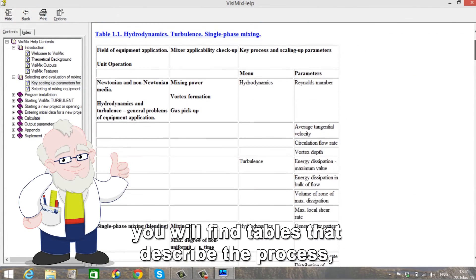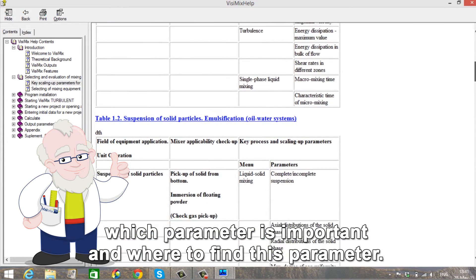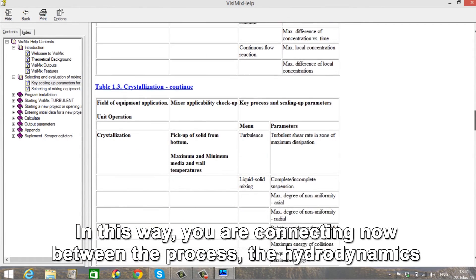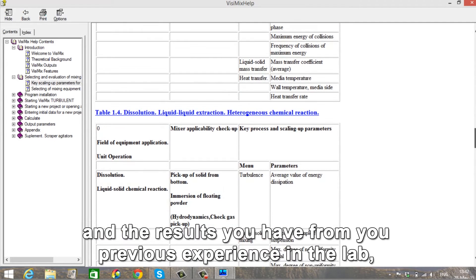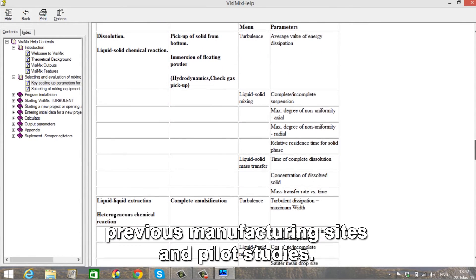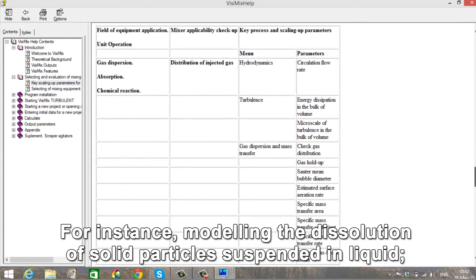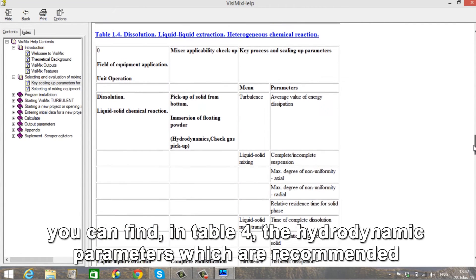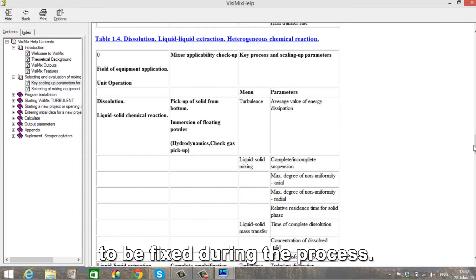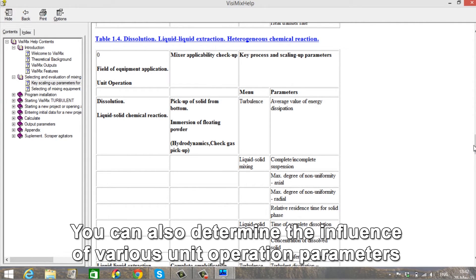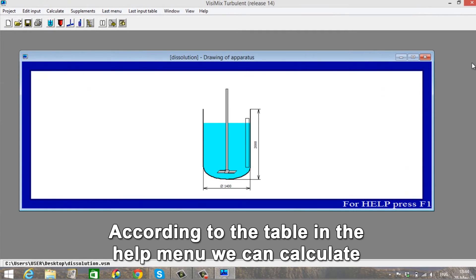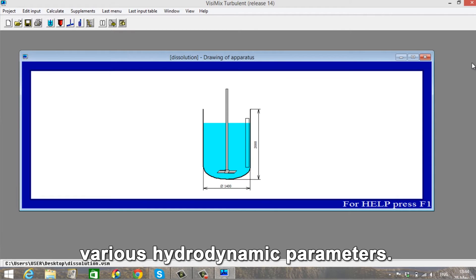You will find tables that describe the process, which parameter is important and where you can find this parameter. In this way, you are connecting between the process, the hydrodynamics and the results you have from previous experience in the lab, previous manufacturing sites and pilot studies. For instance, modeling the dissolution of solid particles suspended in liquid: you can find in Table 4 the hydrodynamic parameters which are recommended to be fixed during the process. You can also determine the influence of various unit operation parameters on mixing effectiveness. Close the Help menu. According to the table in the Help menu, we can calculate various hydrodynamic parameters.